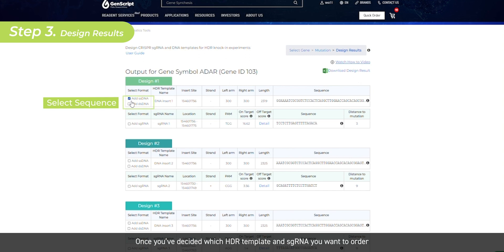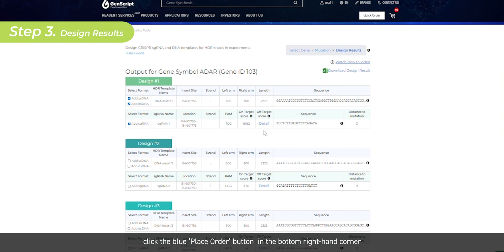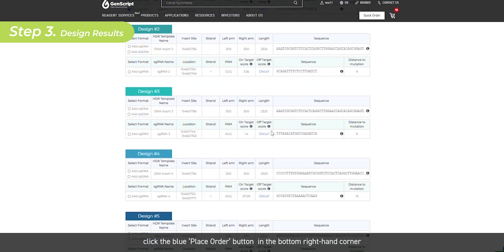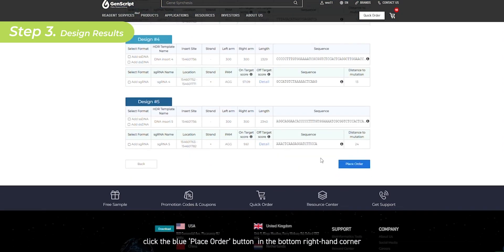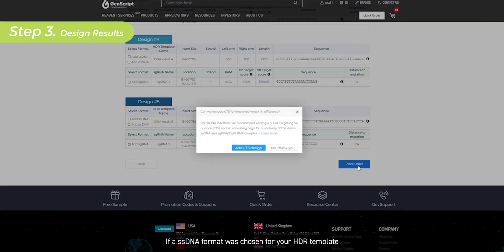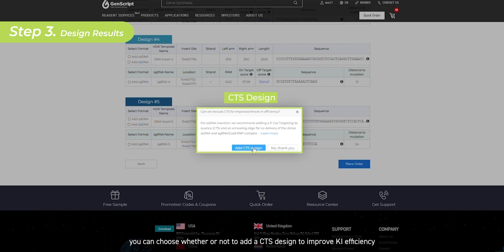Once you've decided which HDR template and sgRNA you want to order, click the blue place order button in the bottom right hand corner. If an ssDNA format was chosen for your HDR template, you can choose whether or not to add a CTS design to improve knock-in efficiency.